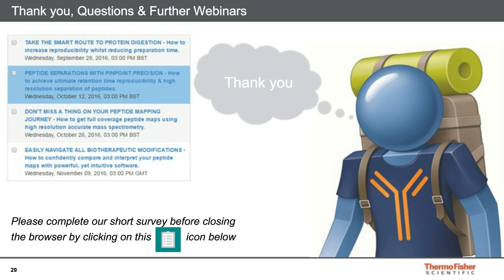Just got some more questions coming in now. Here's an interesting one. What are the advantages of Vanquish Horizon versus Vanquish Flex?